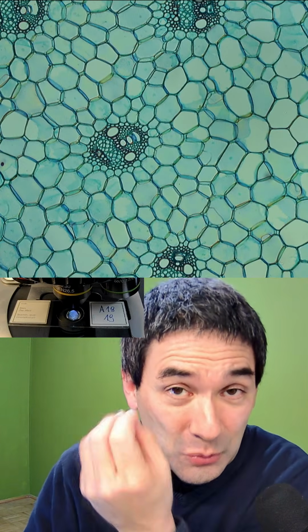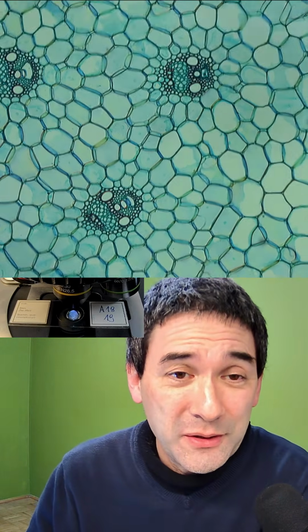We'll quickly also explain a little bit of what you're able to see here. Those round things are the so-called vascular bundles. These are basically the cells that carry water up the plant, and also nutrients like the glucose that was made down to the roots. So that's the cross-section of a stem. In a typical monocot plant, you see that those vascular bundles are scattered throughout the stem.